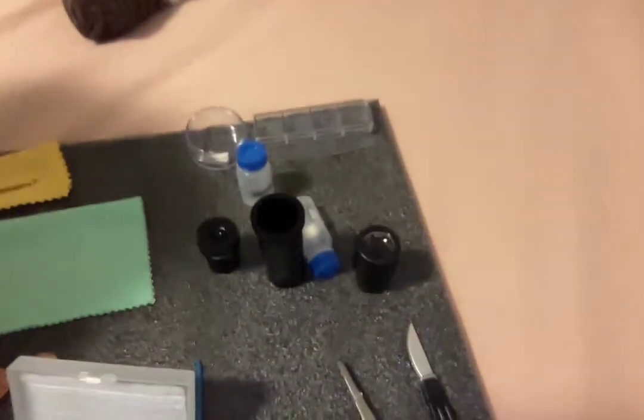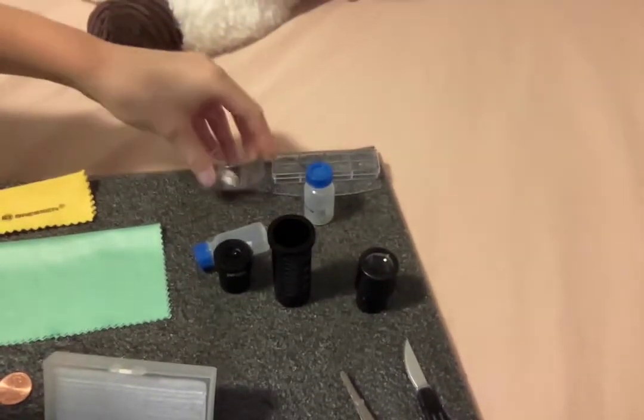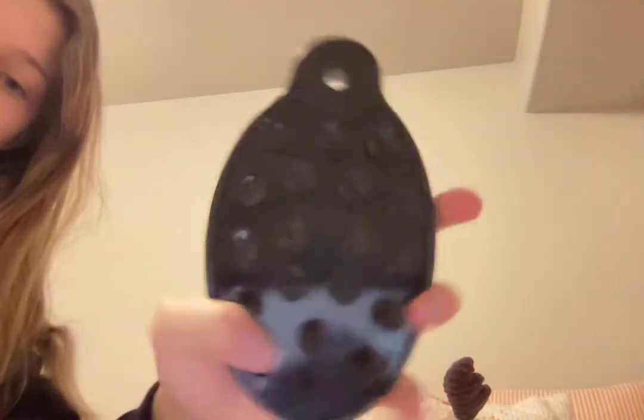It also came with three lenses, two specimen bottles, vials, some shrimp hatchery kits, and a little holder for stuff. Oh yeah, and it also came with one of these phone holders — you stick it like this, put your phone on it or your laptop in it, and these things stick.